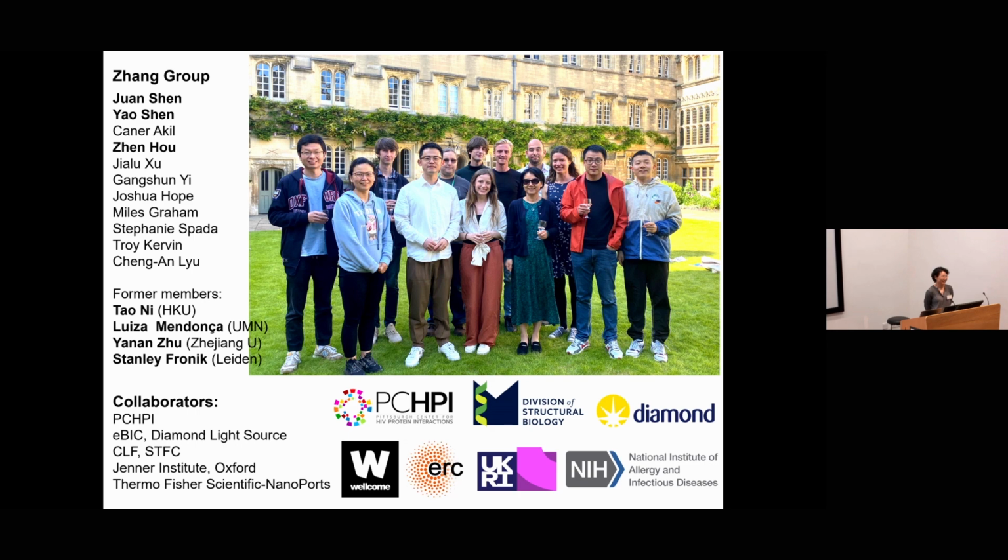So in C1 they also appear? In C1 they also appear. Okay. Because C1 really is not C1, as you know. If the molecules are quite symmetric, even if you do C1, you cannot differentiate the different orientations if the density or resolution is not clear enough.